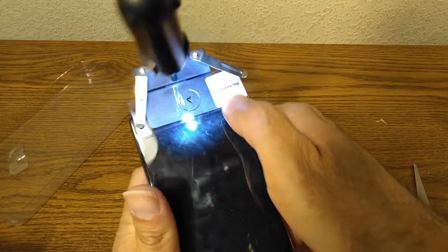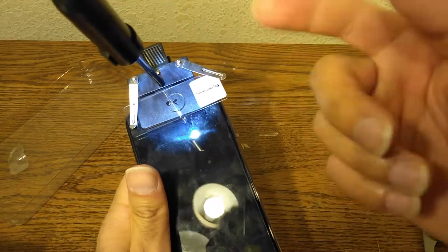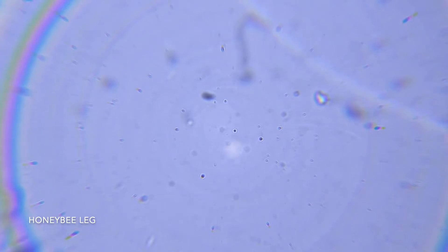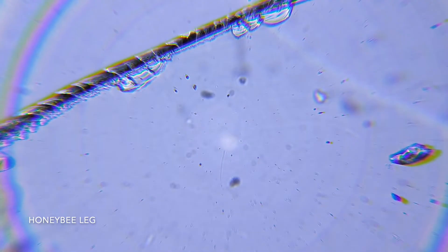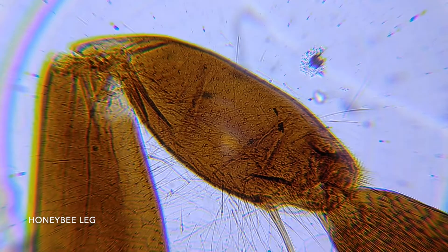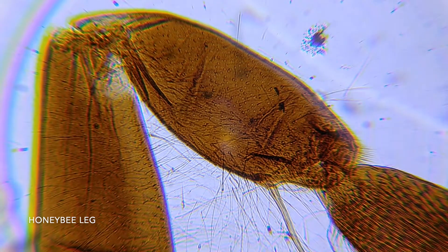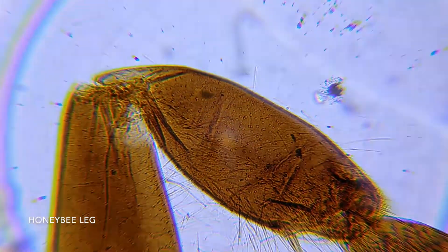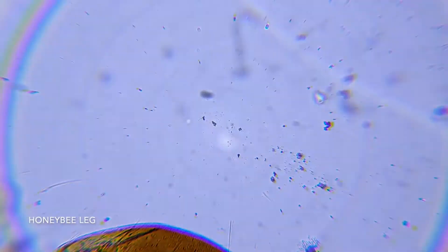Right now we have a honeybee leg, so let's look at the honeybee leg. Okay folks, we are aligned. Here is the honeybee — it's dead of course — and as you can see, it does look hideous.